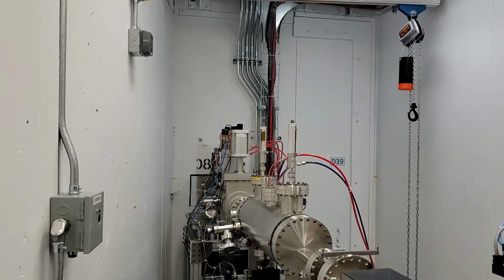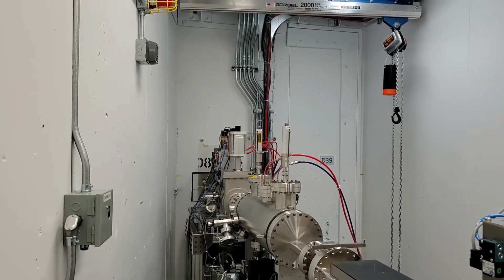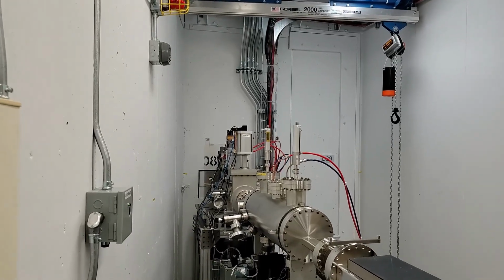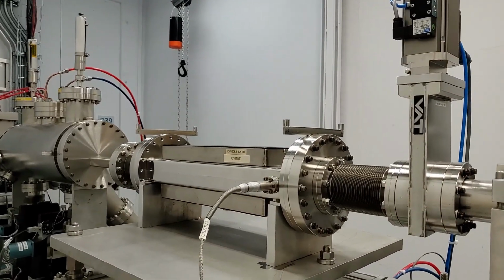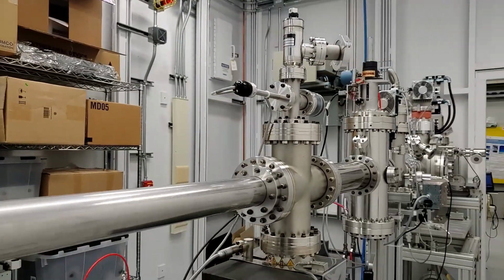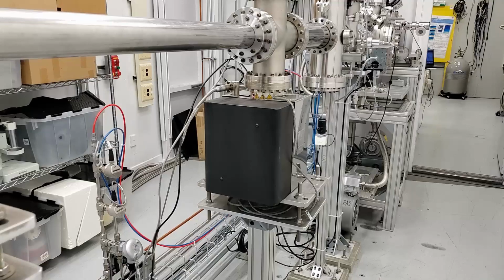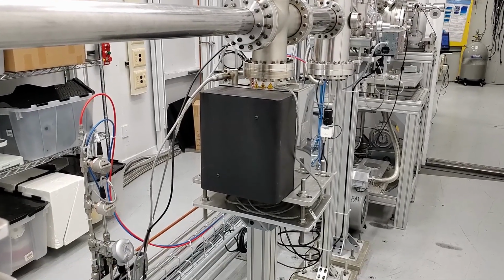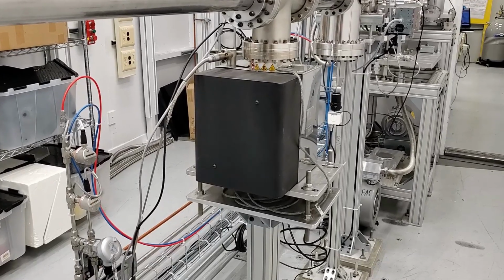At pressures this low, the remaining gases are not fluids, but instead behave more like ping pong balls, bouncing around the system at random, so it's not possible to suck them out. The pressure is maintained by using ion pumps like this one, and this one. These pumps work by creating an electric field potential of several thousand volts, which ionizes any gas molecules that wander into them, and then trapping those ionized molecules by burying them in titanium plates.